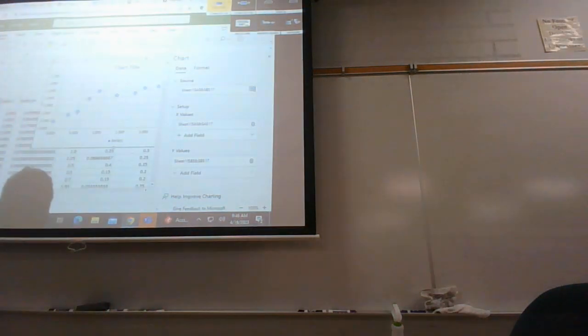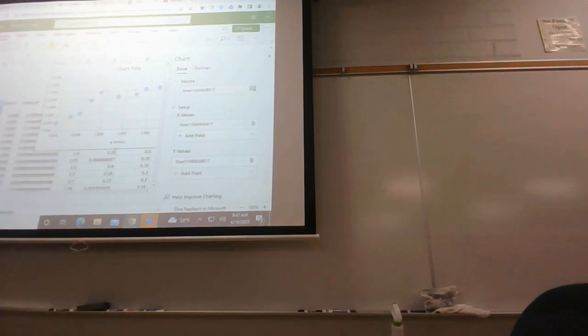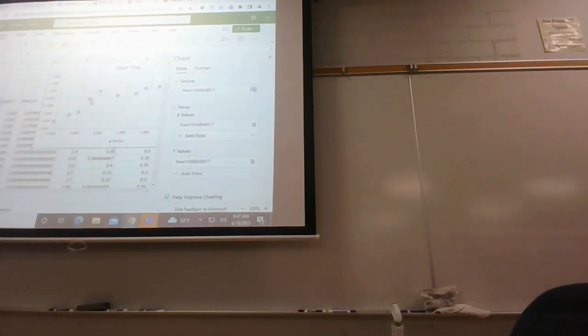Samples. I'll wash them and then put them in the drying oven, so it's not going to take too much time. It was brought to my attention that the Excel app on the El Camino Outlook, or Microsoft Office 365, doesn't have the add data function. So since that's the case, here if I wanted to add or format data, I can't.